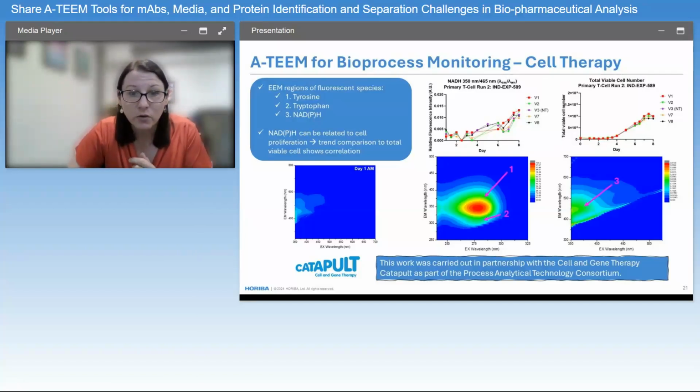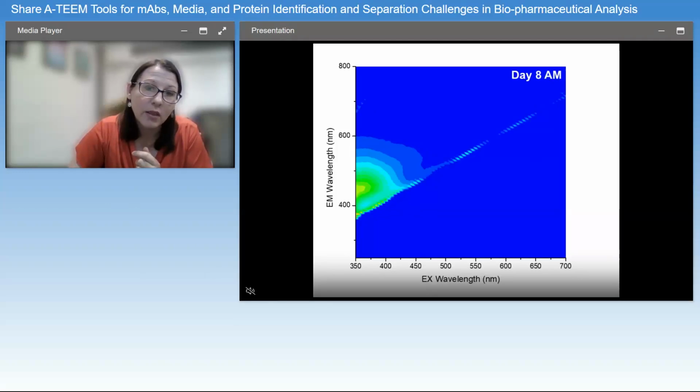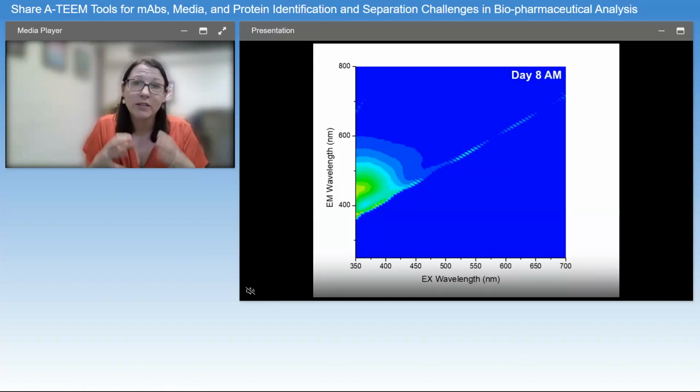And I have a short video to show just the process over some changes. It's just a short video, but it shows that when the cells are growing, the A-TEEM is also changing.